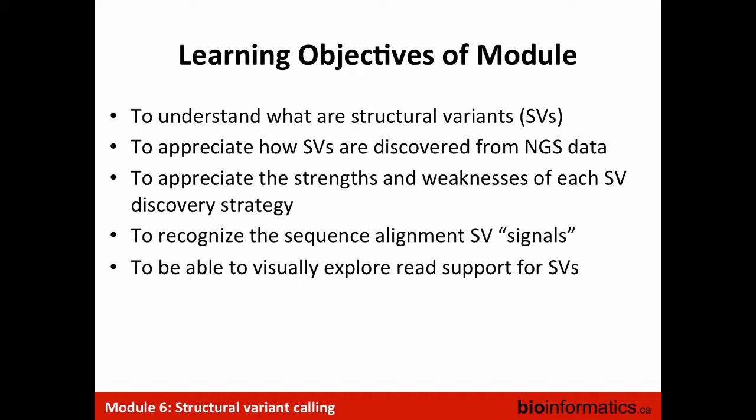You'll see that in the case of the first module, I really went over a pretty well-established pipeline, this GATK framework. For structural variants, you'll see that there's really still work in progress, and there are lots of different tools. We're only going to be using one, but I'll at least try to give you a sense of the types of tools that are available. And then in the practical, we'll be using one tool in particular, and we'll visually explore some of these structural variants.